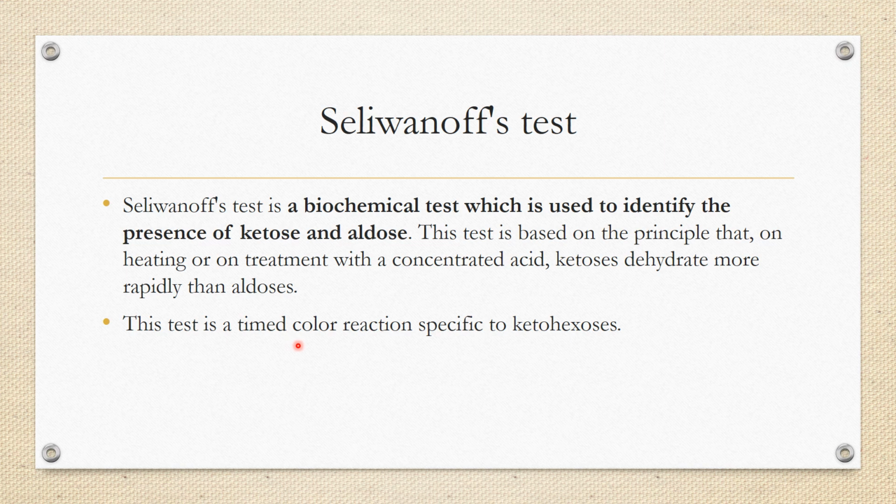But if it takes a prolonged time, the positive result also can appear, but you will say it's negative because it's more than 30 seconds.